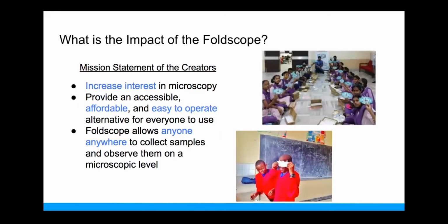What is the impact of the Foldscope? Well, the mission statement of the creators is they really wanted to increase interest in microscopy as a field and provide an accessible, affordable, easy to operate alternative for people who may not have either access to any equipment or any opportunity to get into microscopy. The Foldscope allows anyone anywhere to collect samples and view them on a microscopic level. On the right, that's a technical school in India using it, and on the bottom is a school classroom in Tanzania, I believe.